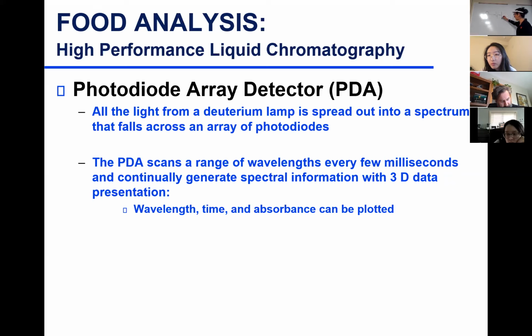And then from there it is going to go into a prism or a grating system that's going to diffract the light into multiple lambdas, different wavelengths, x1 through whatever. So what happens here is all of the light is going to hit your sample. The different components in the sample are going to absorb a different wavelength. So the light coming out has reduced power at specific lambdas.